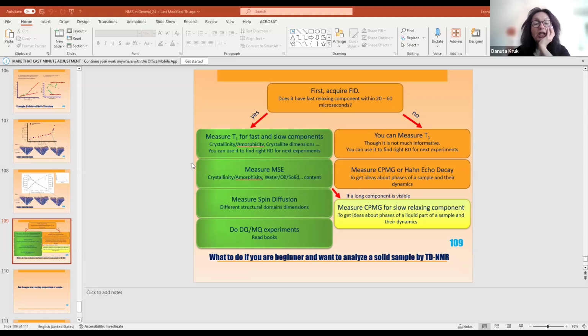For instance, if you take fluoroaniline, this is what we just investigated, and Adriana can say something about it. Although you have proton and fluorine nuclei in the system, relaxation theory tells you that for such systems, in principle, spin-lattice relaxation should be exponential.